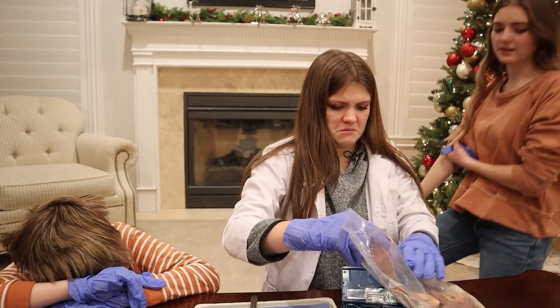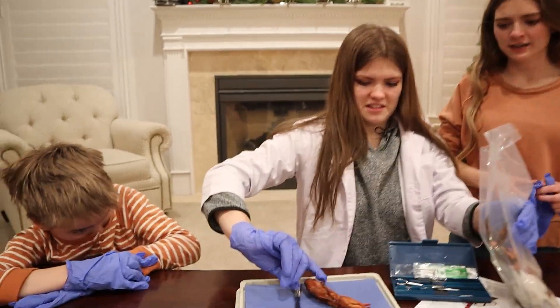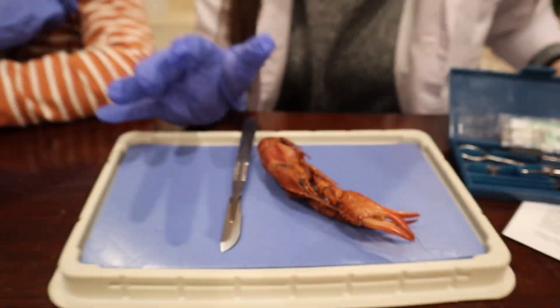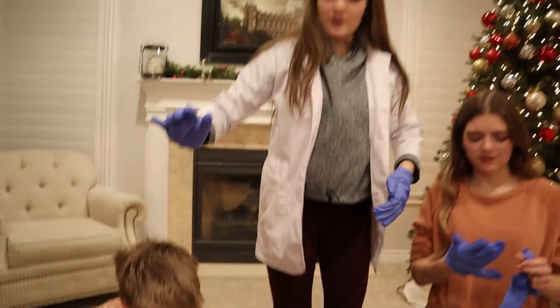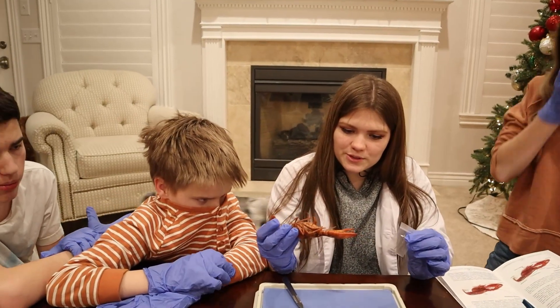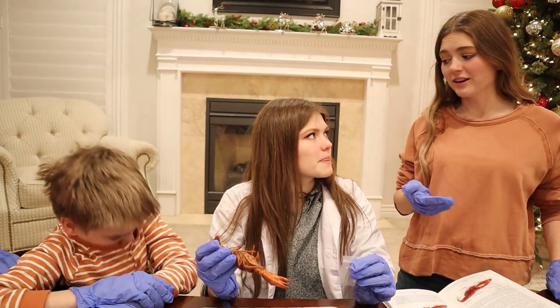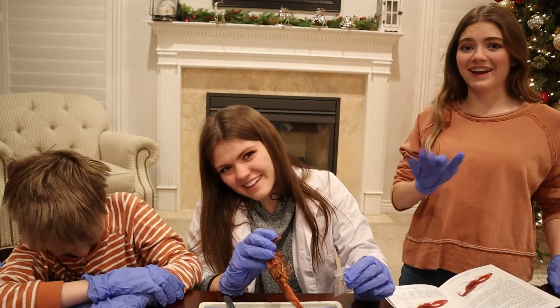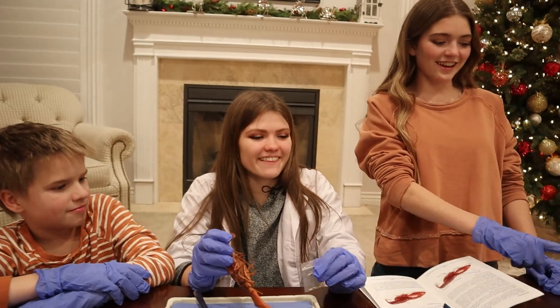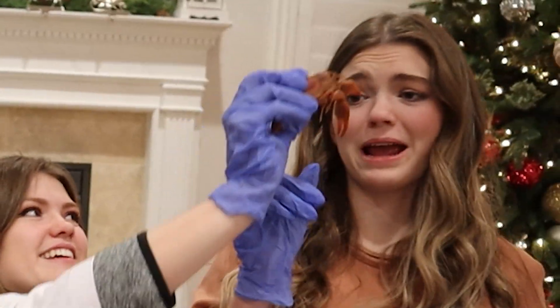Oh, it's got an antenna! There we go. It smells so nasty. I feel like that dude — I also have my lab coat on. All right, let's pin our lobster down and start the dissection. I know I'm gonna get little juicies all over. Oh my gosh, he looks so angry.